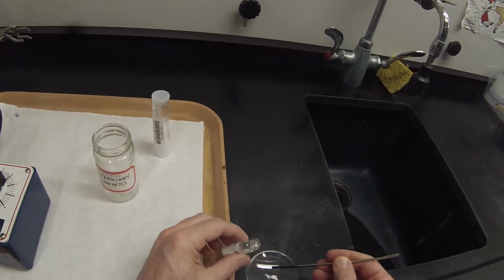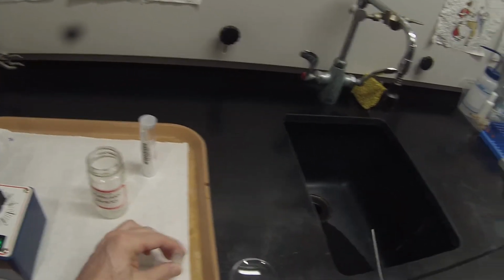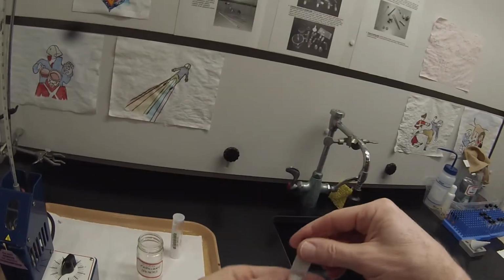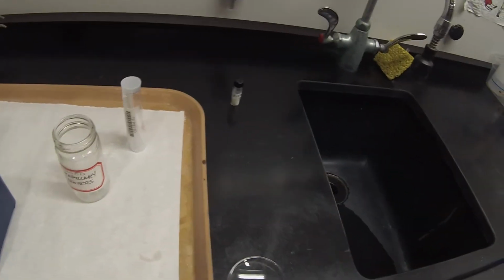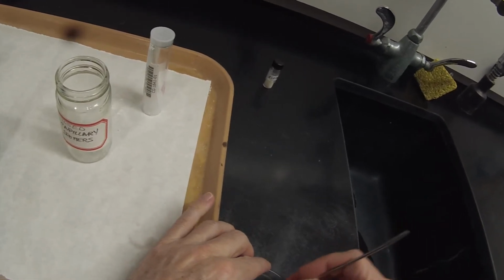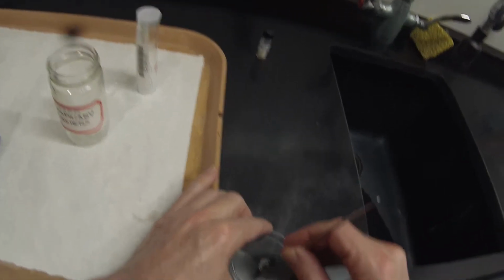I've got plenty, so I don't have to really worry about wasting it. Set that aside. That's way more than we need for NMR, assuming the NMR ever works again. And then I really want it to be kind of uniform. I want it to be as powdery as possible.